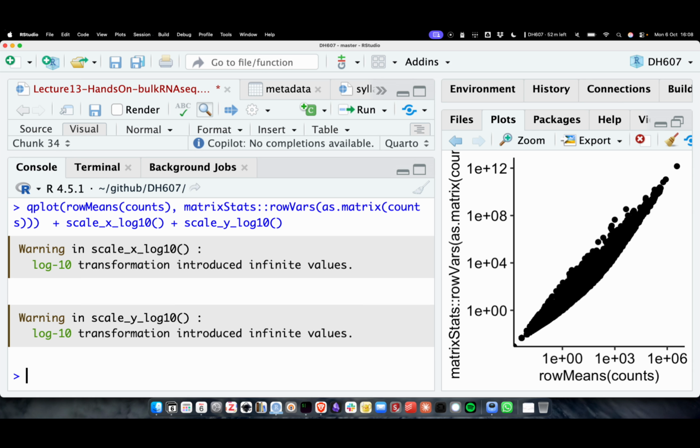In this case, what you're seeing is a curve which looks like this. Right. So this A means whatever the spelling is. You can figure out the right spelling. But it's a curve which follows a relationship between variance and mean. And whenever you see heteroscedasticity, particularly when the variance is a function of mean, that's usually not good. Usually you would want to remove that effect before you analyze your data.